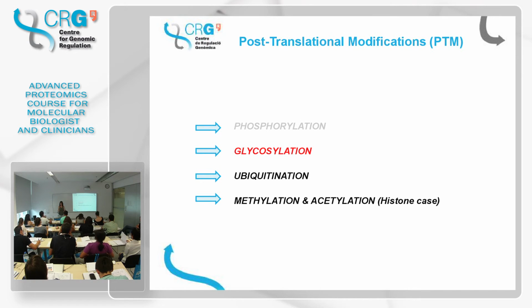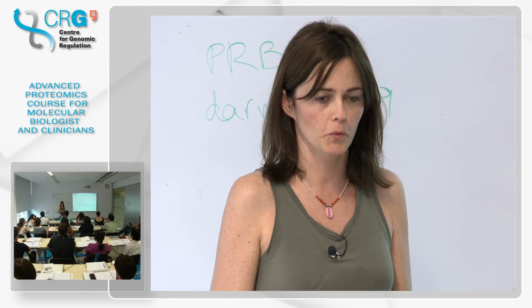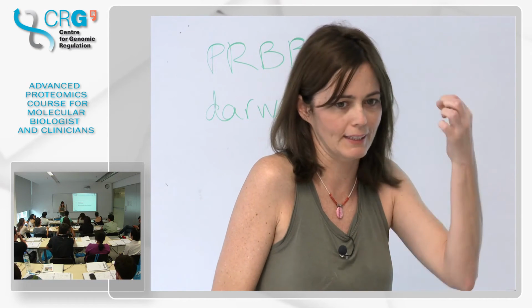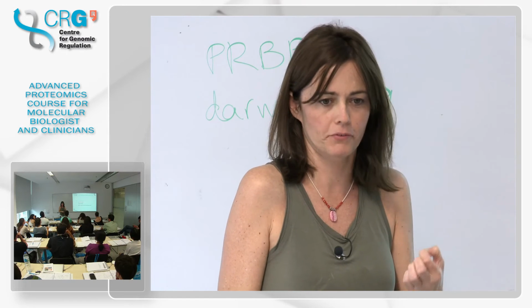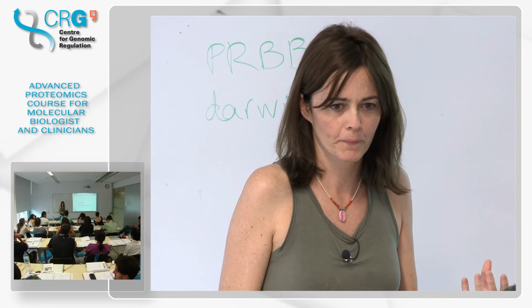Do you have any question about phosphorylation? So for the case of this case of site localization, there was no solution because... No, we not always are able to know where was the phosphorylation. If there is no ion that is the indicative of where the phosphorylation was, we won't know.